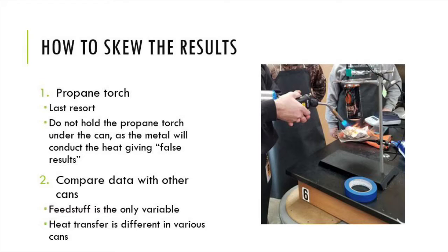Students will never get perfect results with the setup in this lab as you would within a bomb calorimetry setup within an animal science laboratory. However, there are a few things that can skew the results. One is improper use of a propane torch. Propane torches are a last resort, but if you pull one out, try not to hold it directly under the can — even if you're collecting data afterwards, you are putting heat into the area and allowing that conductivity to happen, giving false results. Next, comparing data with other cans: the feedstuff should be the only variable. The can you use should not be a variable within this lab.